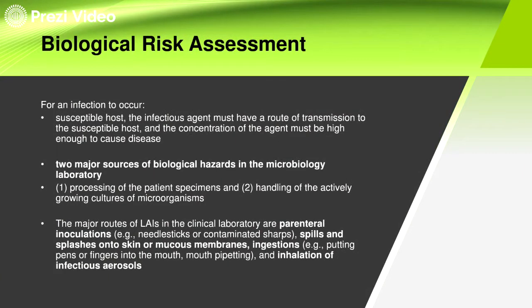Now, what is biorisk assessment? So, when you say biorisk assessment, this is a process. Process ito in order for you to identify what are the different risks in the laboratory and how are you going to manage those risks. Okay? So, first, under the biorisk assessment is to determine the following. Una-una, who is the susceptible host?